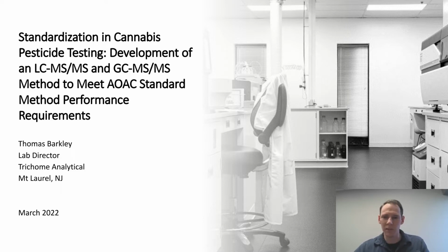My name is Tom Barkley and I am the lab director at Trichome Analytical. Trichome is a third-party cannabis testing lab located in New Jersey. And the topic of my talk today has to do with standardization in cannabis pesticide testing, particularly the standardization of pesticide testing analytical methods. So today I'll be presenting a method that I've been developing to meet the AOAC standard method performance requirements.